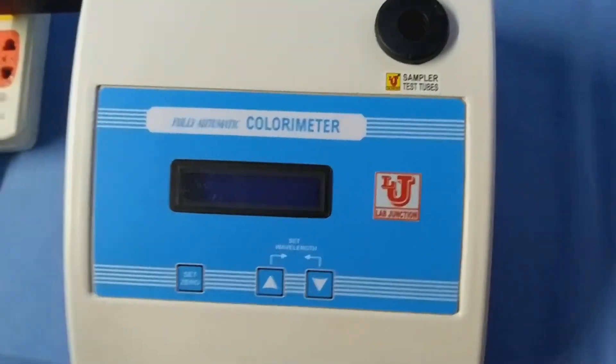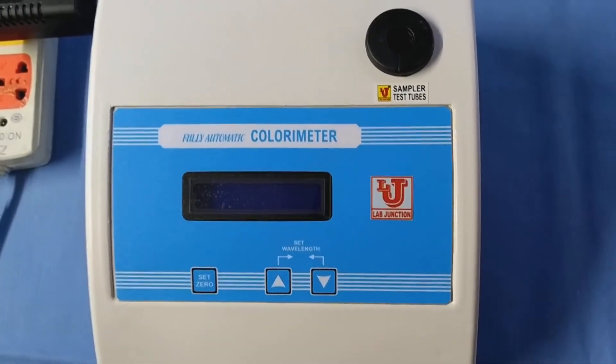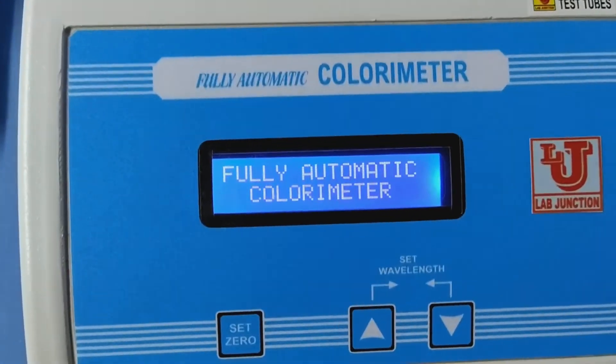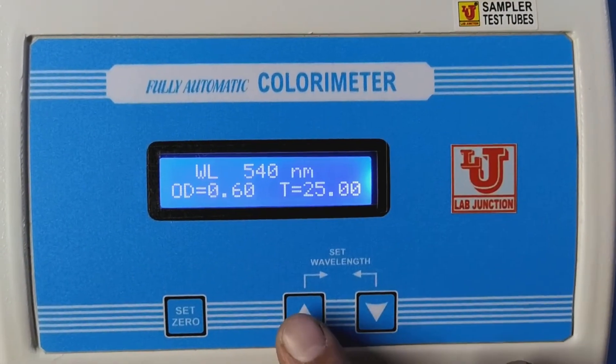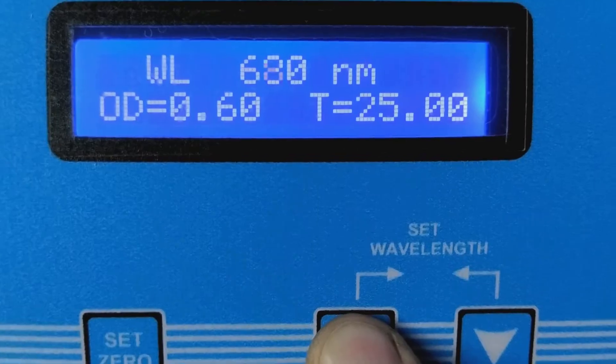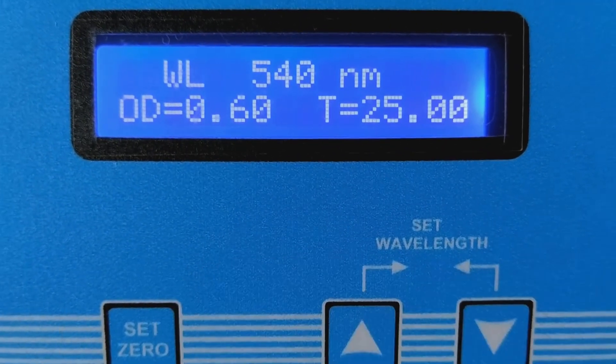Now, I am doing glucose test from this colorimeter. You have to switch on the machine colorimeter. First, you have to set your wavelength. I am setting it to 540 nm.